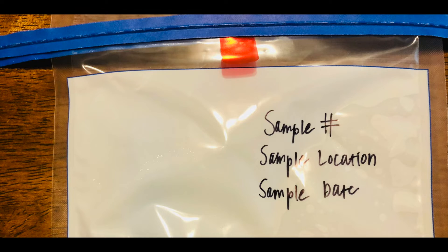After the sample has been collected and the sponge is in the bag, take the permanent marker and write the sample number, the sample location, and the date the sample was collected. This sample is now ready to be logged and submitted for laboratory analysis.